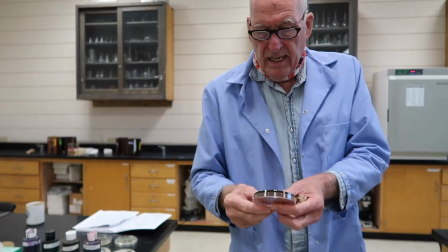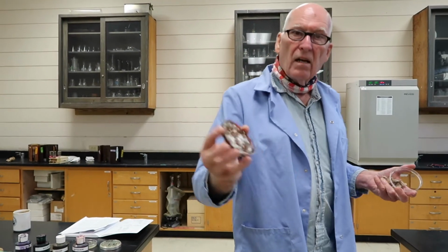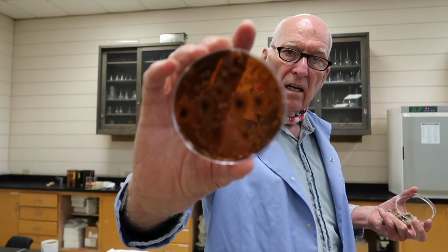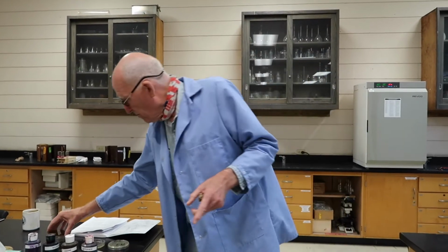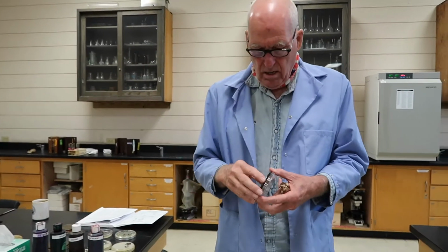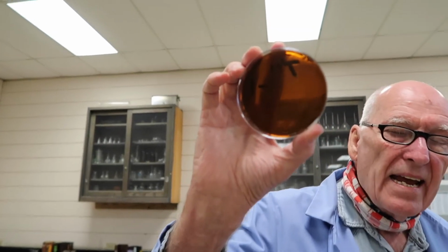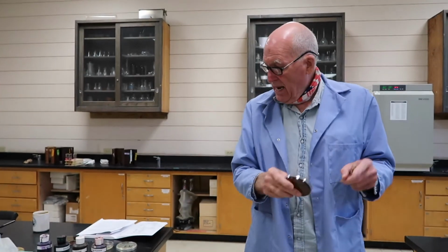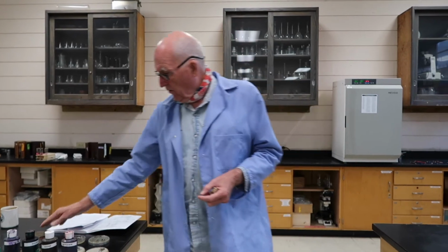So at T2, that's 2 days, these coliforms are still around, and a lot of them. So when I measured it at T4, you can see that we're not getting any coliforms. They have died out. Whatever's growing back there is not gram-negative. So the pH and the acid is knocking out what we don't want, which is the coliforms.